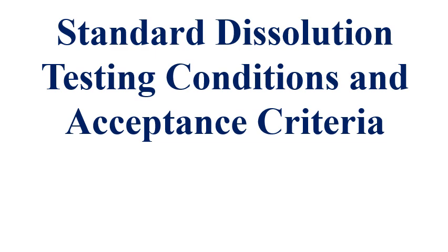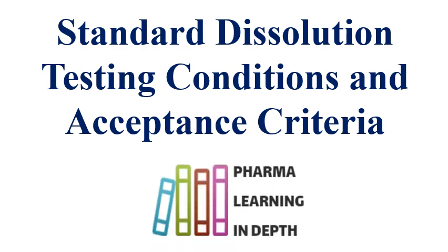Hello and welcome, dear viewers, to the video on standard dissolution testing conditions and acceptance criteria. When you are performing dissolution testing, the dissolution parameters or conditions, or you can say dissolution test parameters, should be standard. As per the regulatory requirements, the dissolution testing conditions and parameters should be standard and should be mild.